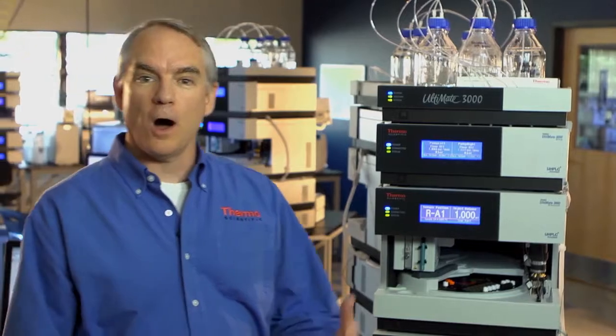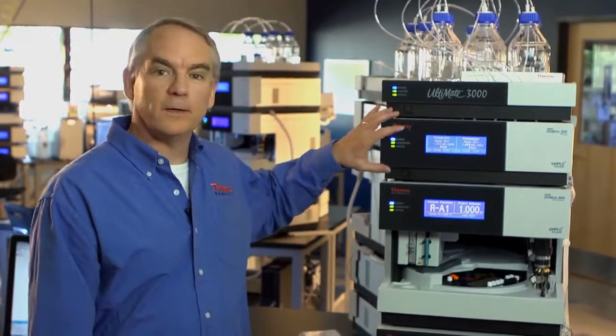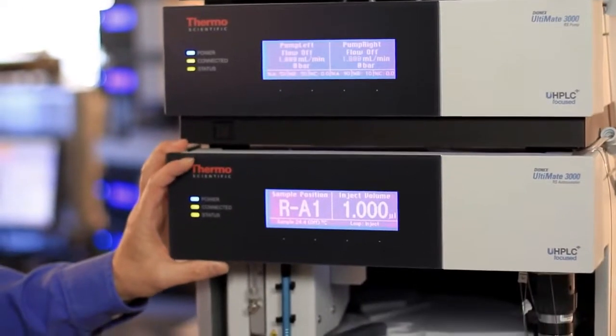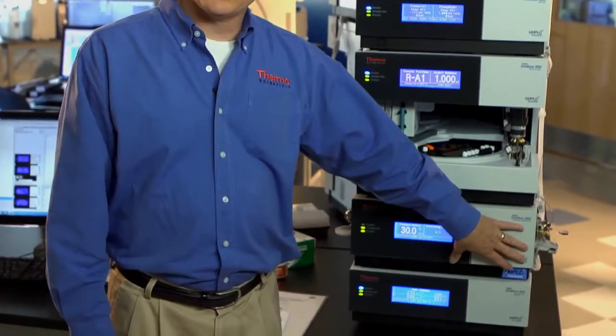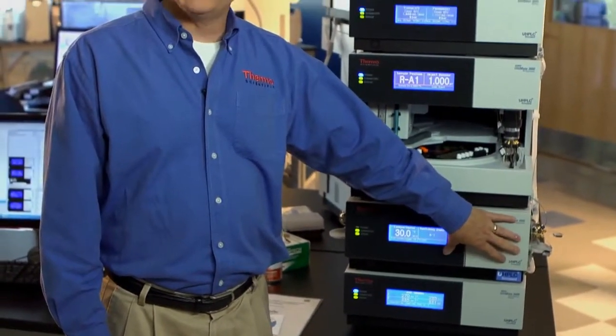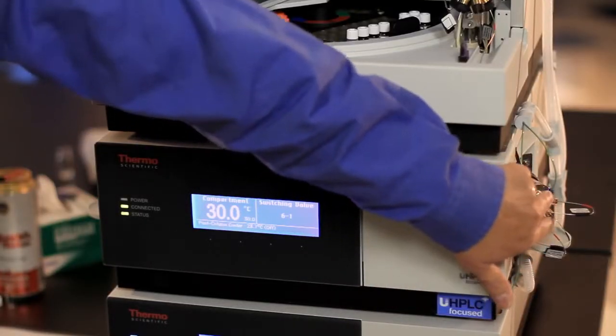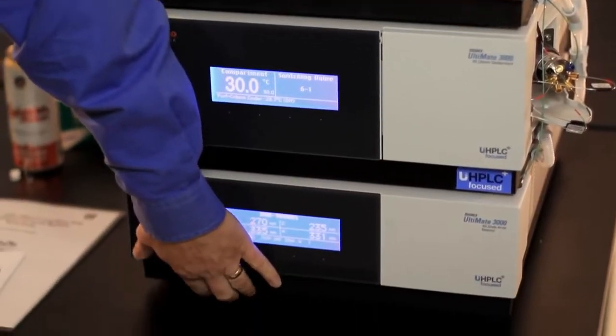The system that we're going to implement online solid phase extraction on is the Ultimate 3000 UHPLC Plus system. This is a system that includes a dual gradient pump, a split loop well plate sampler, a thermostated column compartment, and within here as I'll show you later we have the two different column chemistries, and we have a six port two position switch right on the side that allows us to do column switching for the online solid phase extraction. Finally we have a stackable detector at the bottom.